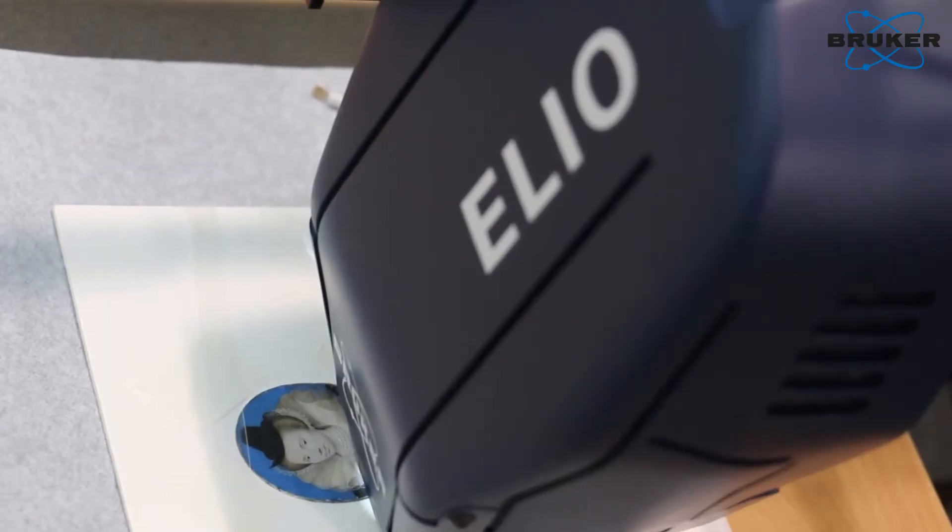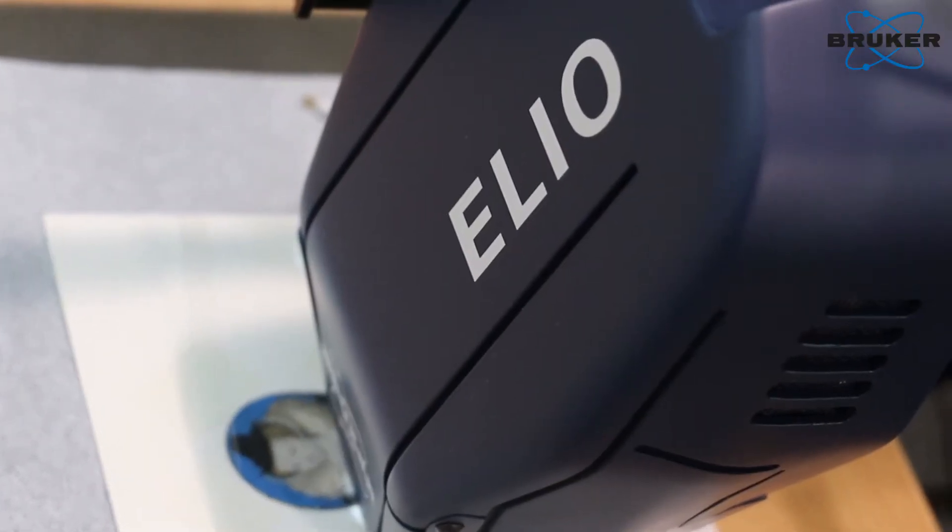When someone made new lockets for these miniatures and tried to retouch any losses or fading, perhaps to make them look a little better — it's really important to us that we can separate these later interventions from the original work of the artist.